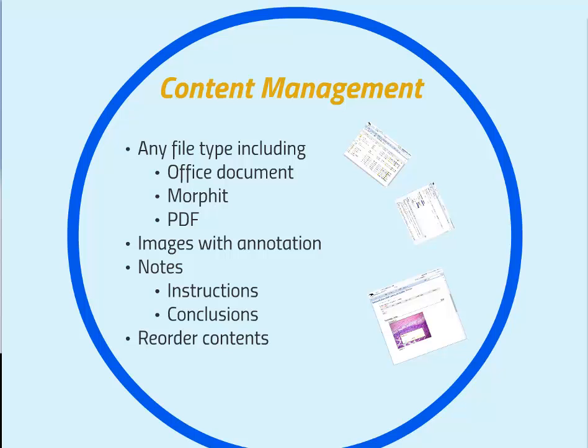If you attach image files such as cell cultures or histology images, they can also be annotated and notes can be added to fulfill and write up the experiment as you would expect with any electronic lab notebook. So we can add instructions of the protocol, we can add details of what actually was conducted during the experiment as well as our conclusions. We can also reorder the contents of the experiment in order to control the format and printout.